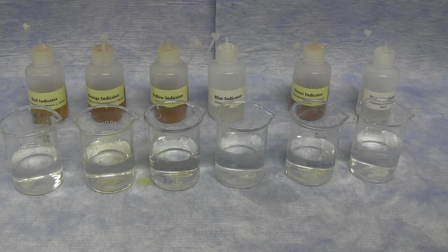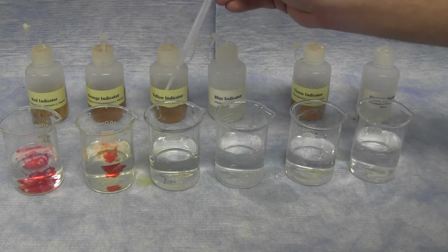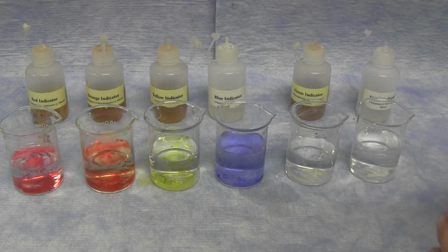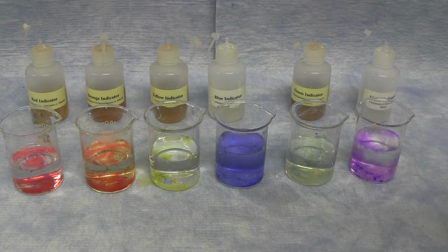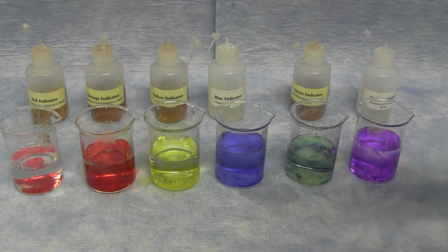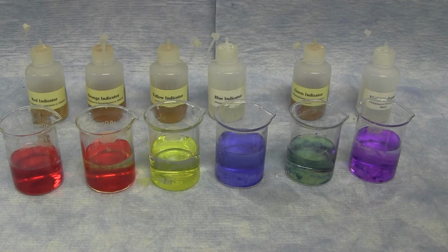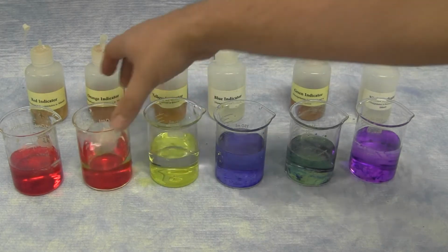However, depending on the indicator, by adding additional base, the color can change for these different solutions. Knowing what indicators are present and at what pH they change color can give a good indication of where an endpoint would be.